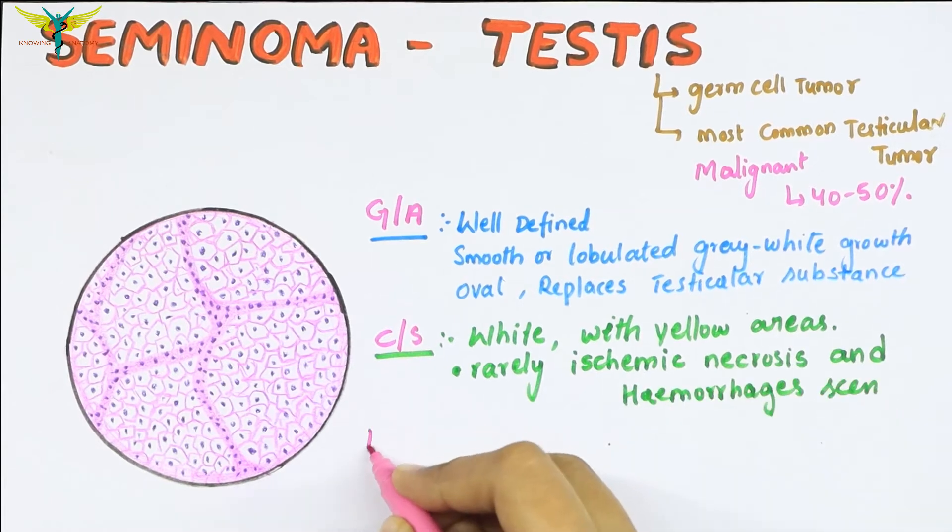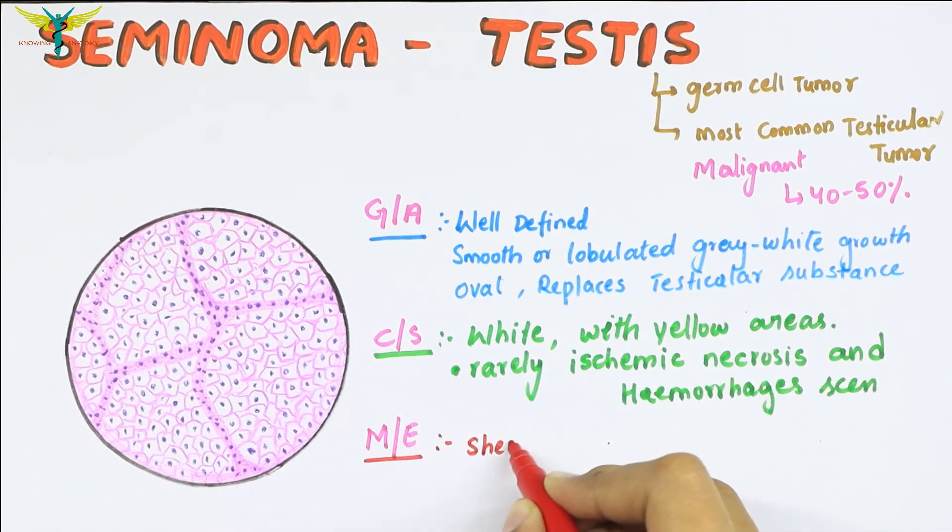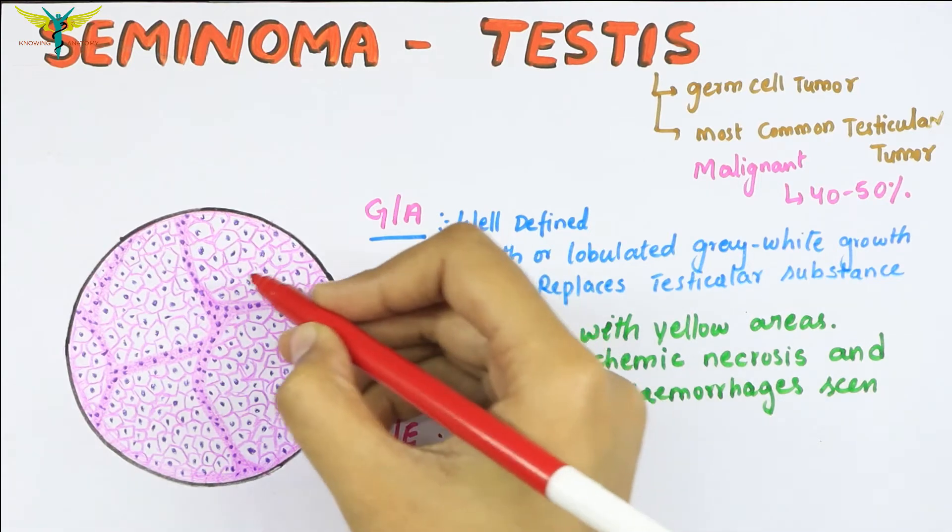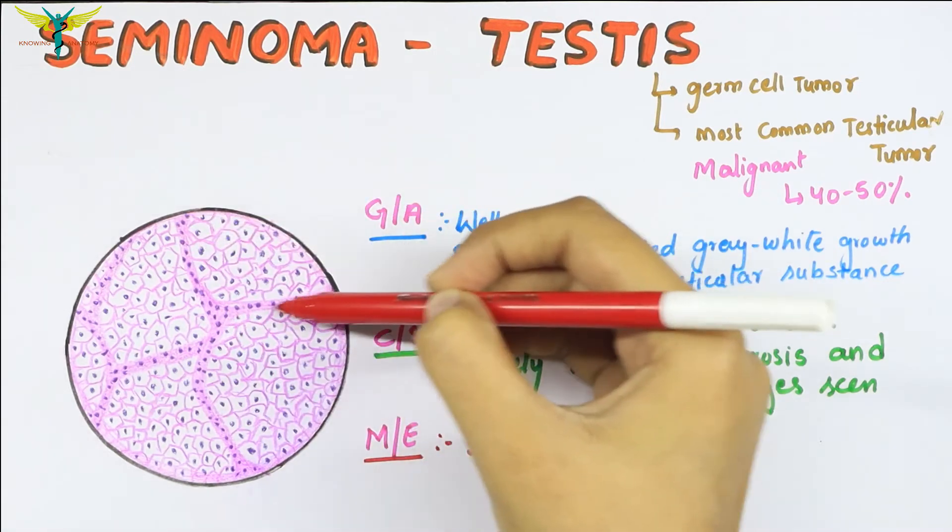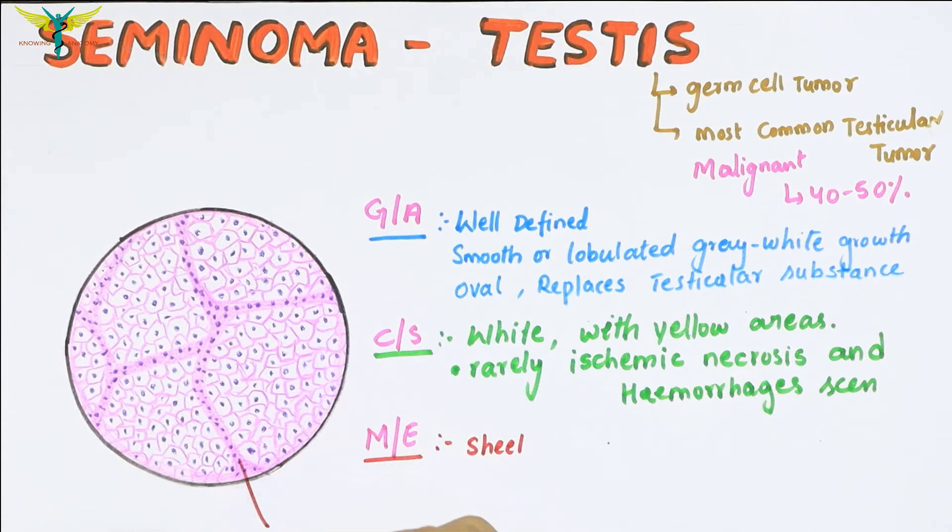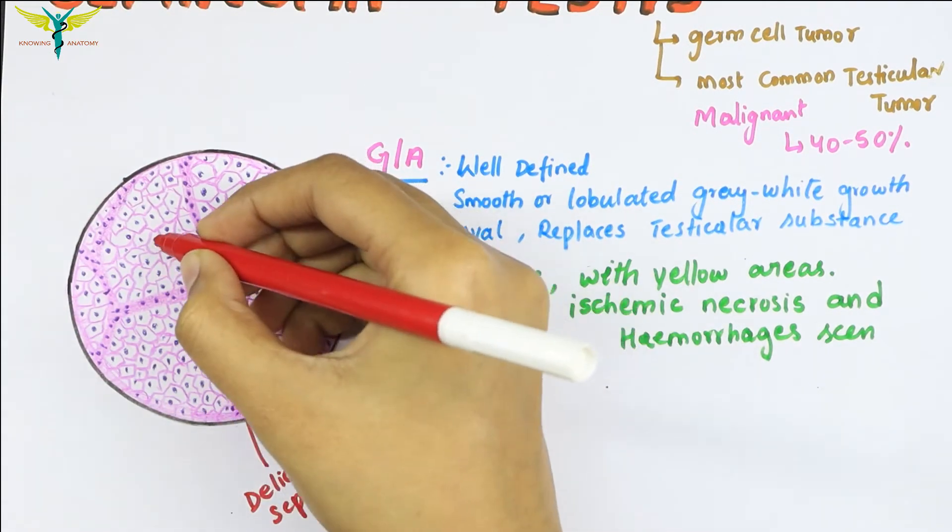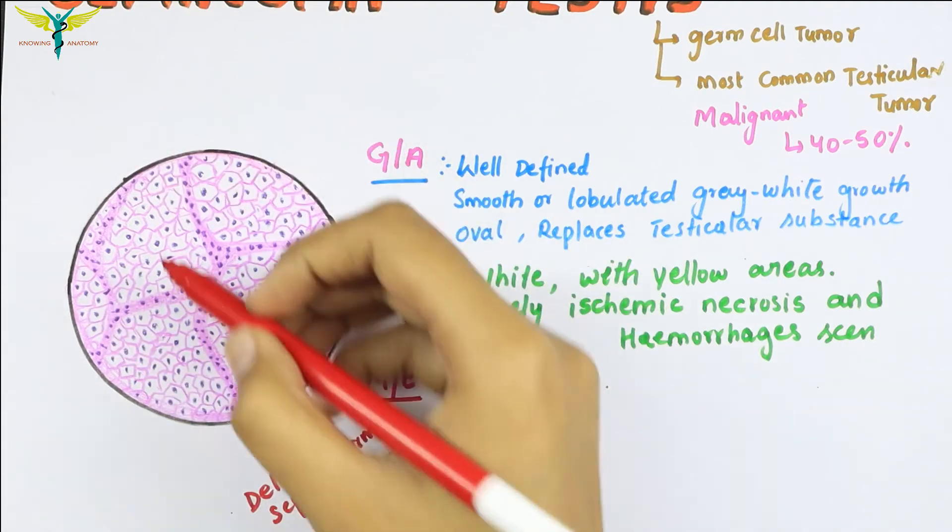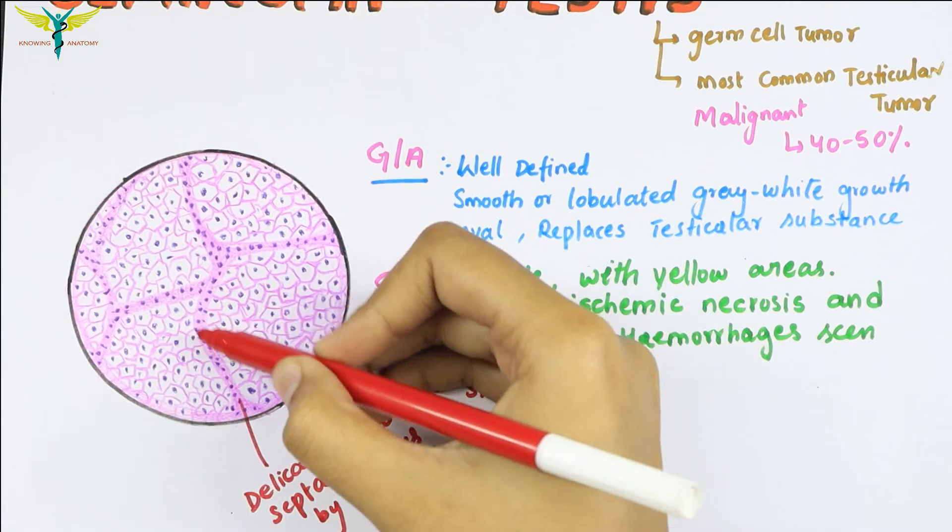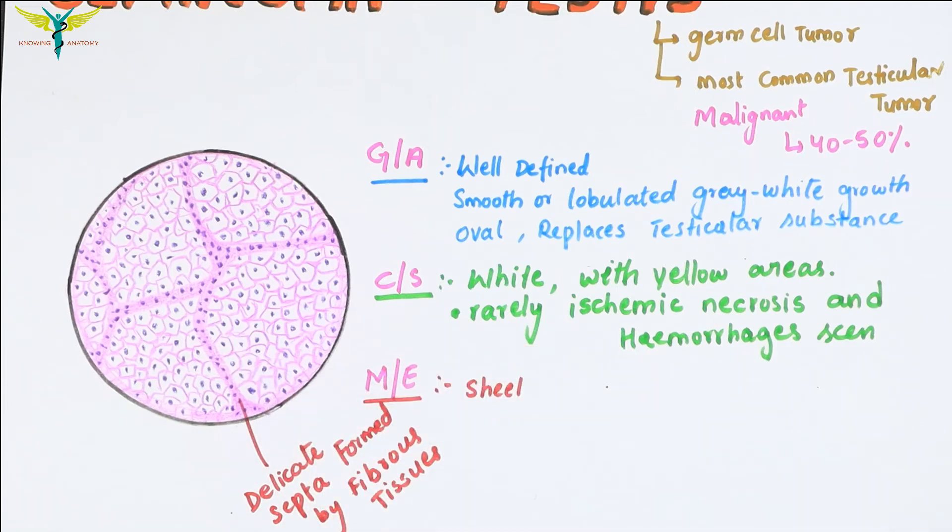The microscopic examination shows sheets of uniform cells divided into lobules by delicate fibrous tissue septas. These are the delicate septas of fibrous tissues dividing the sheets of uniform cells.